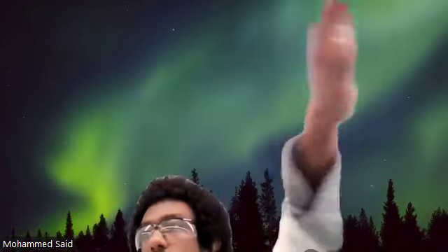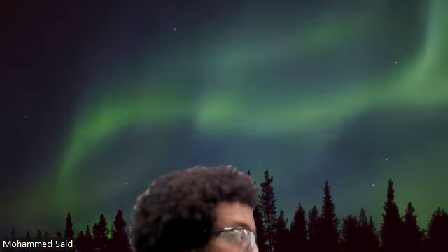The temperatures will be 50 degrees on that side for the back half of the slab, and then the one that's closer to me, this half, will be 65 degrees. The other thing is that you guys may also need to move spots. So if you guys are cool with that, then that's something you want to consider. Okay. And by the way, just to confirm, you guys are okay with the arrangement now. Yeah, perfect. Okay.